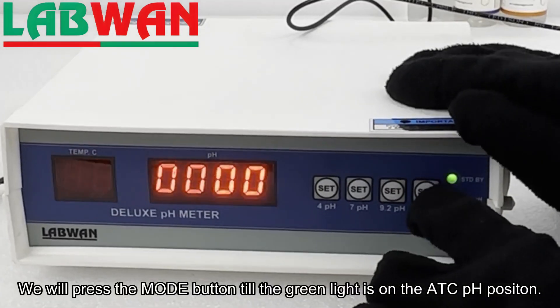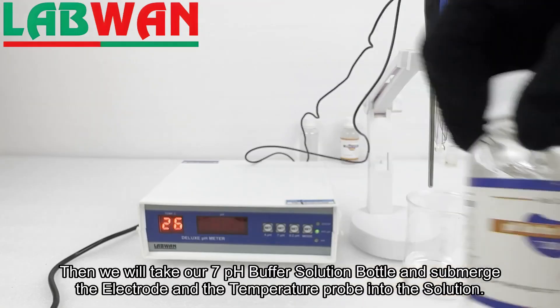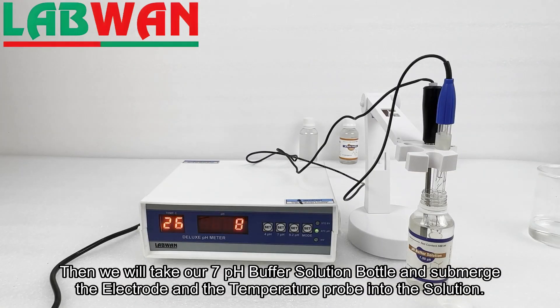We will press the mode button until the green light is on the ATC pH position. Then we will take our pH 7 buffer solution bottle and submerge the electrode and the temperature probe into the solution.